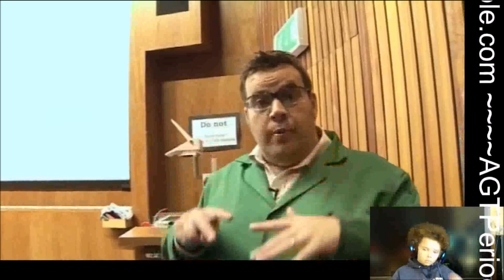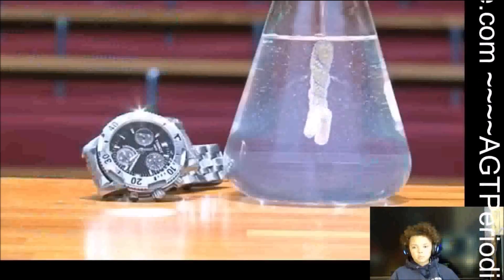Well, I've managed to film maybe 1 minute's worth of time by now. Maybe 2, because we've been away about 2 hours. So we're going to go back and have a look at the flask, see if there's any changes. If you remember when we left, it was a nice clear solution of silver nitrate with some copper wire, which was just immersed inside. So let's go and have a look.